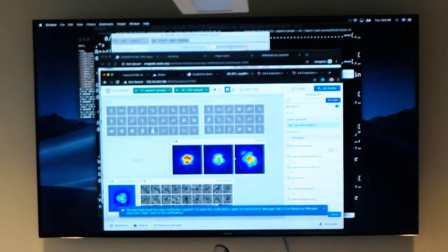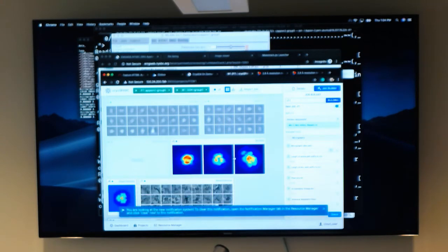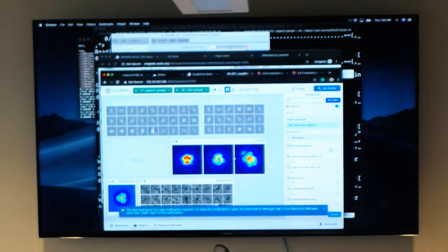This is VC1, right? And queue job on default. So it's kind of like, yeah, with the right processing lane. I see. So you have heterogeneous refinement, right? And then you choose one of these and do homogeneous refinement on this one, and then do the second one. Yes. So the selected classes from the subset selection. Define what it, input it defined means it grabbed it, right? Somehow it must have been able to find the subset selection because it grabbed particles.